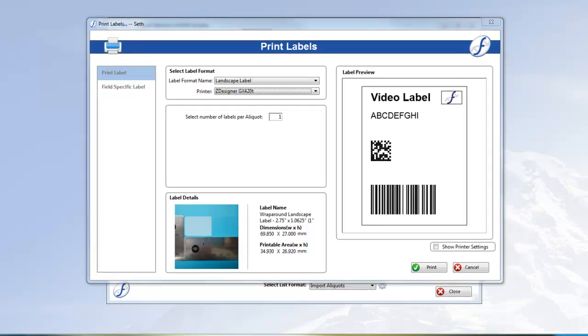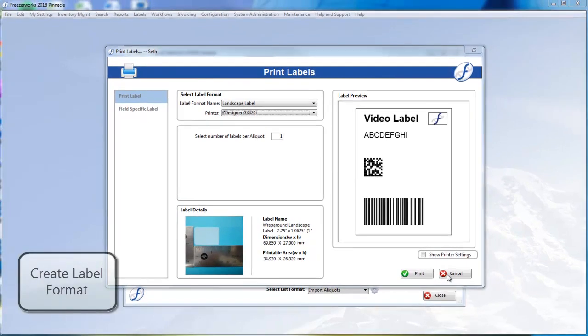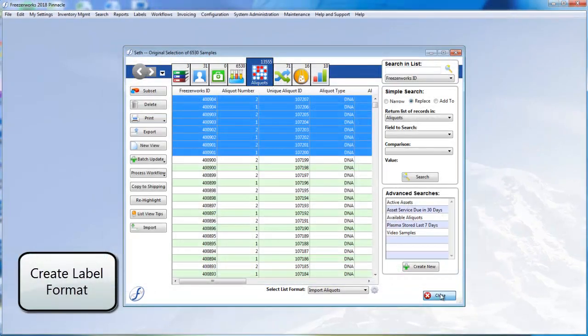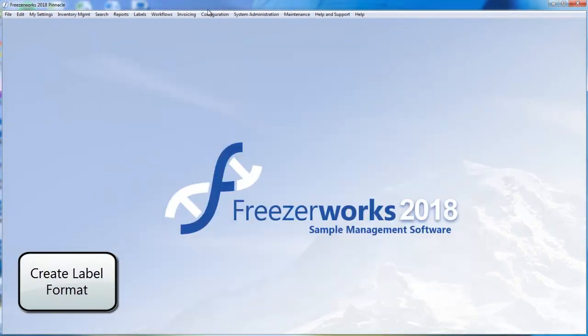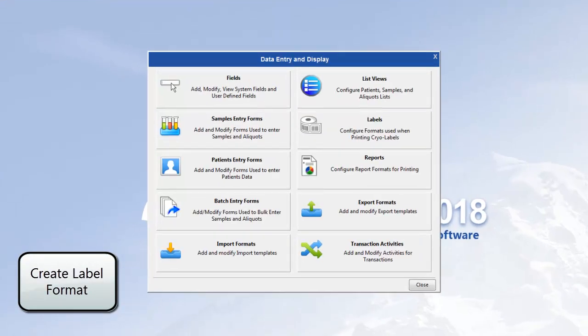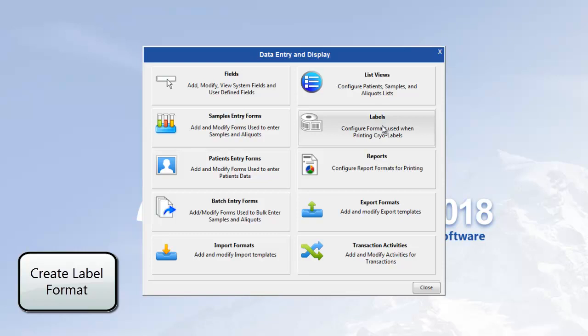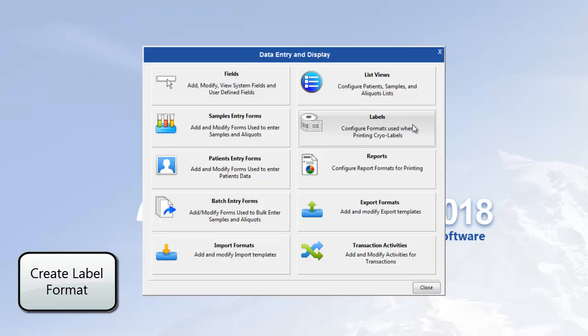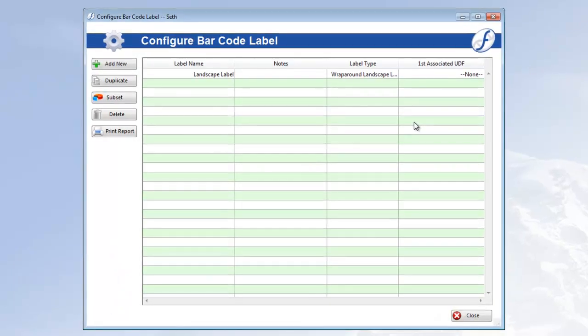Let's start by opening the Configuration menu and selecting Data Entry and Display. Now click the Labels button on the mini-menu. This opens the Configure Barcode Label List View. From here, you'll create and maintain your label formats.